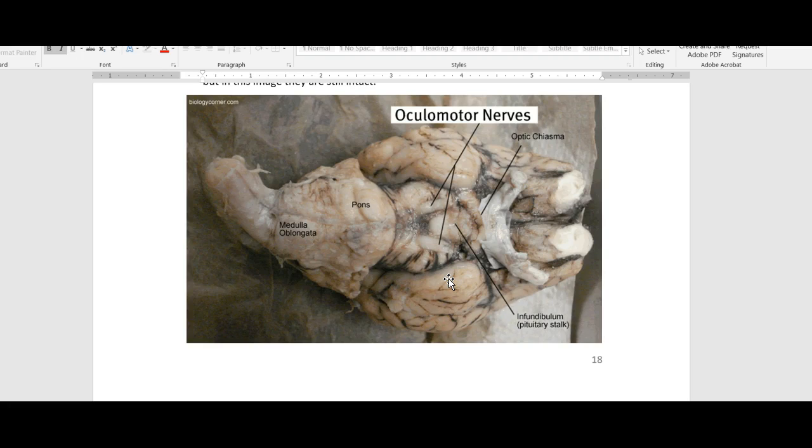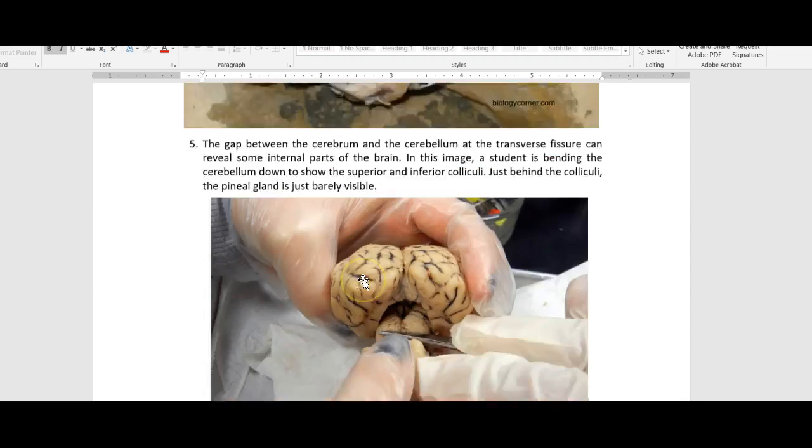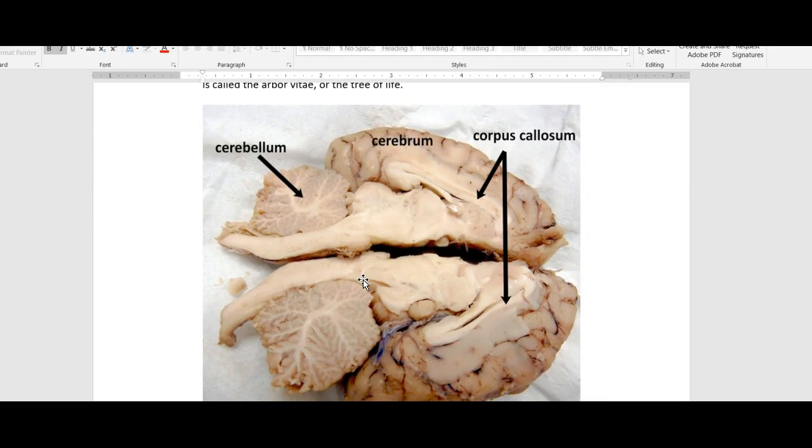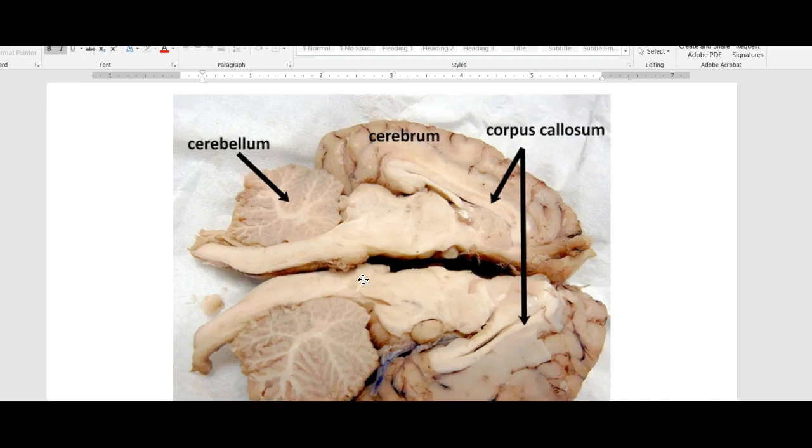It doesn't have to be perfect, but all of the structures will look a little bit better if you're really close to the midline like that. So find that little hole on the bottom, go straight in, cut forward, straight in, cut back. The closer you can stay to the center line on the way back, the better it will be. And then when you get it in cross section, it should look something like this.